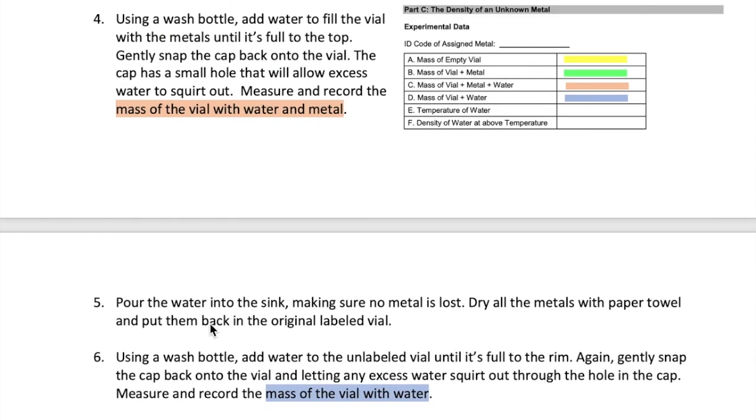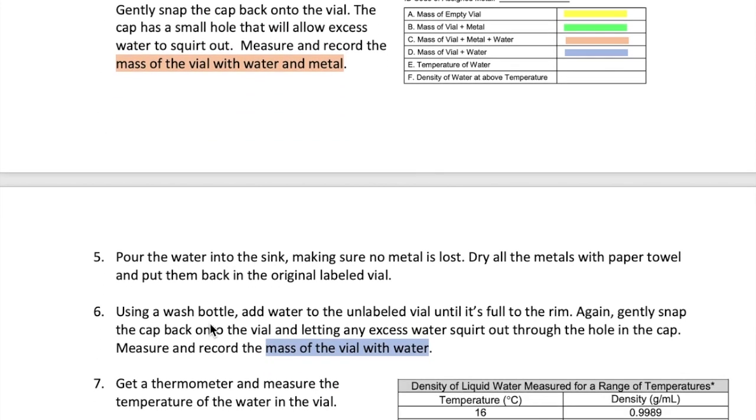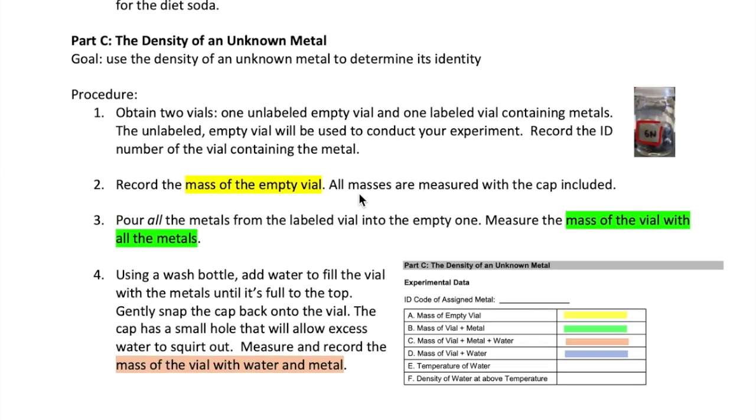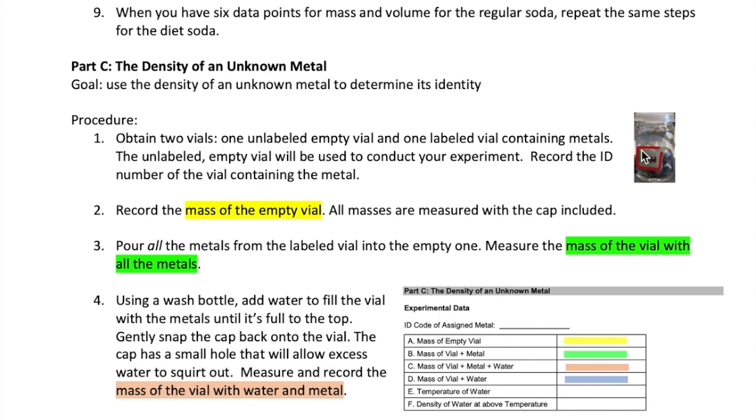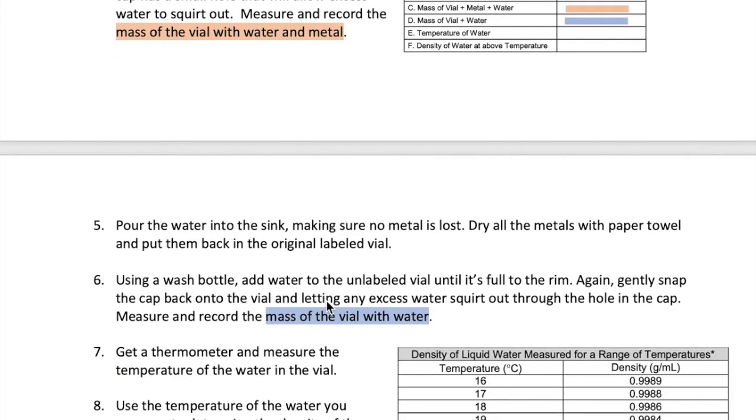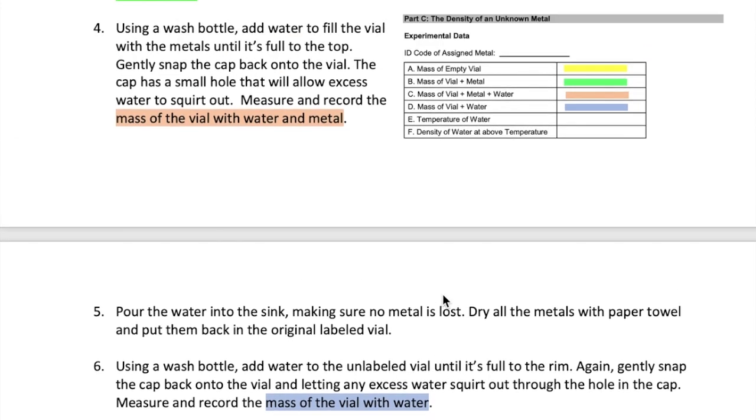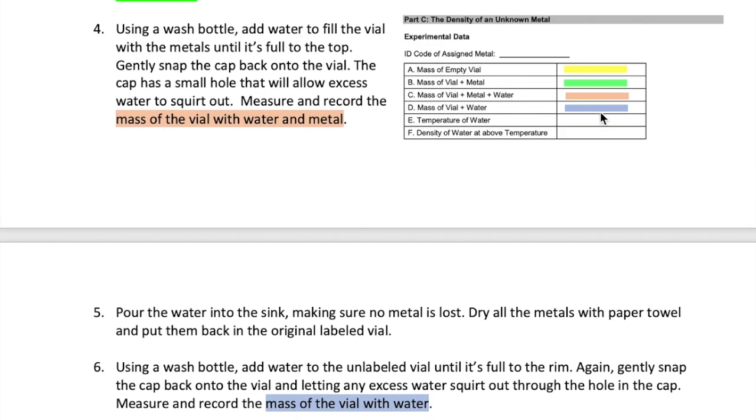Lastly, you want to pour out all the water and carefully remove the metal pieces. Dry them and then put them back in its original vial that has the label. Now, add water to the empty unlabeled vial until it's full to the top again. Gently put the cap back on. Dry the outside of the vial and then measure the mass of the vial containing just water now and record it here.